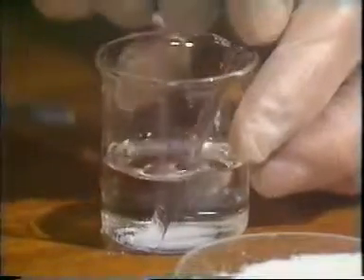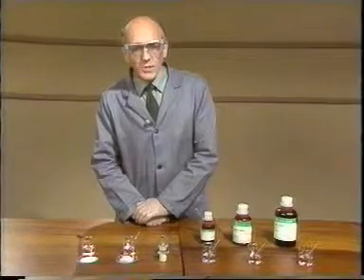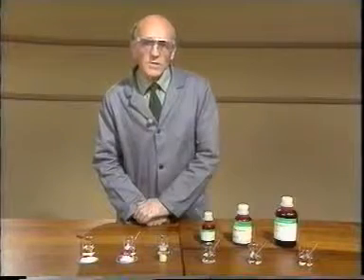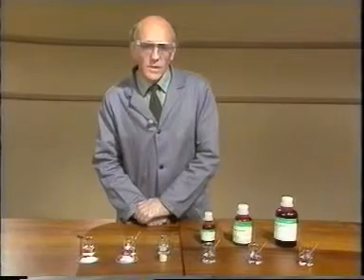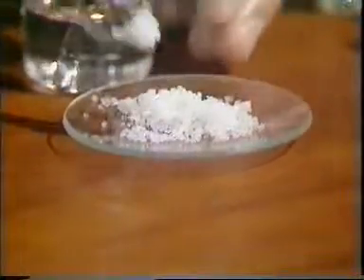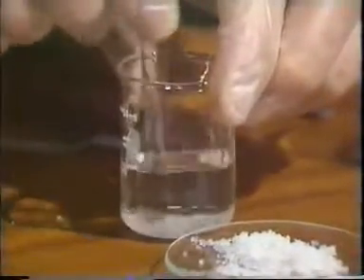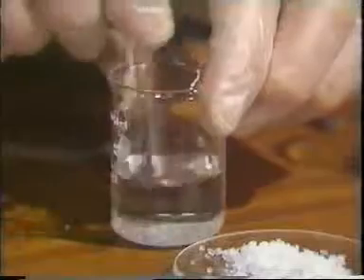So if the rule of like dissolves like applies, then we might expect ionic substances not to dissolve in hexane, whereas the covalent substances perhaps will. Let's try the rest, and this should enable you to classify these chlorides as covalent or ionic. Magnesium chloride next. If I stir this, again there is no sign of the solid dissolving.